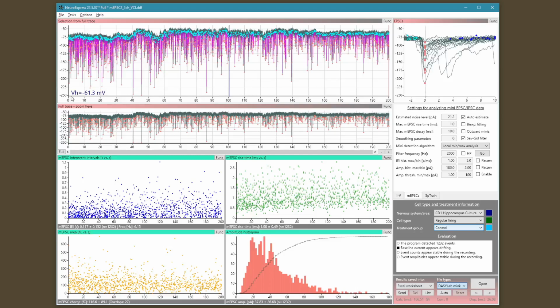So in this case, there is a control section, and then you can define a range of interest which is associated with the drug application. Again, you bring up the pop-up and you define range of interest. So in this case, you can say this is where you apply the drug, and then you will see that there is this empty control section and this highlighted section which indicates that here the drug was introduced.